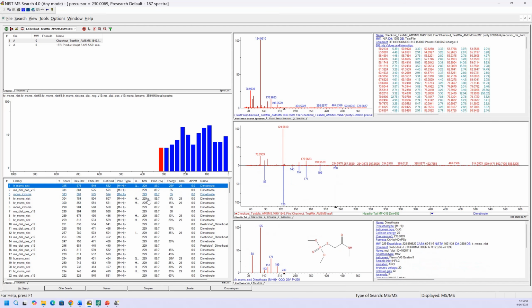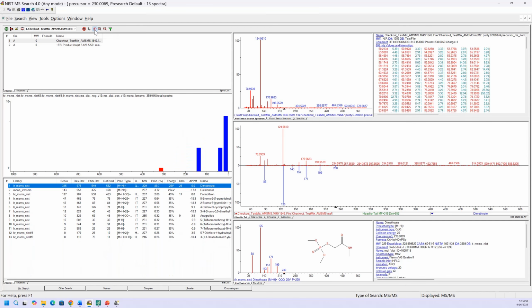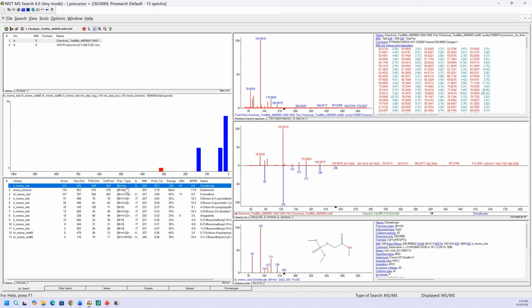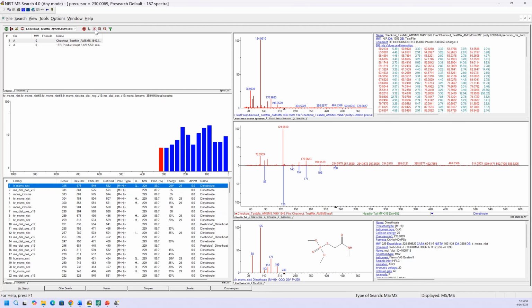The other thing here, you're getting a lot of the same hits over and over again. Remember the chromatogram tab only shows the best hit, but here you get them all. But if you want to get rid of some of them, come up here to the best matching only and click on it. And now it gets rid of things that are duplicates if they have InChIKeys. InChIKeys is just a way of representing a structure, and that's how they decide if they have duplicates, by comparing those InChIKeys. I usually keep this off initially because I want to see all of them, in this case, because I wanted to pick one that had my structure on it.